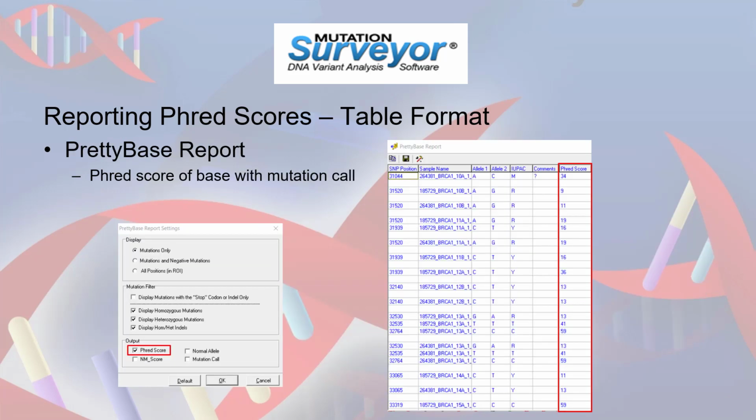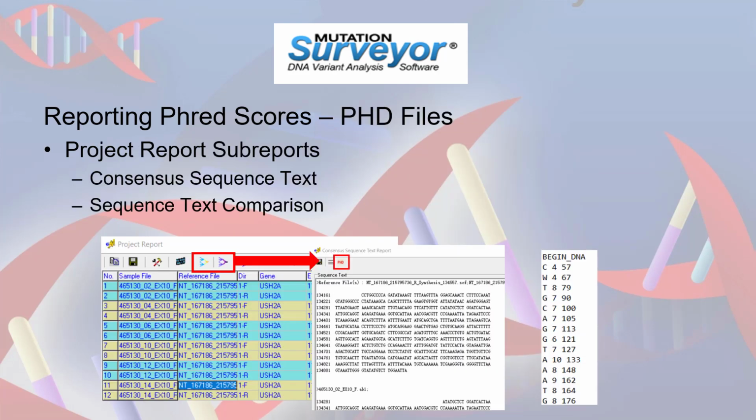The Pretty Base report is another customer report available. With this report, the user can select to include a column which displays the Phred score of the base with the mutation call. Some reports include the option to generate PHD files which contain the Phred score for each called base. These files can be generated from the project report subreports Consensus Sequence Text and Sequence Text Comparison. The Phred score will be displayed in the middle column to the right of the associated base call.